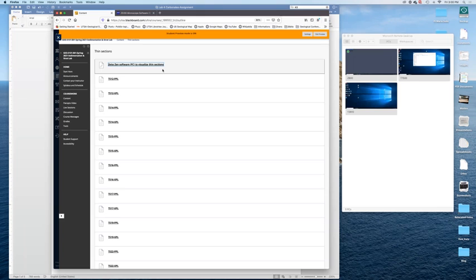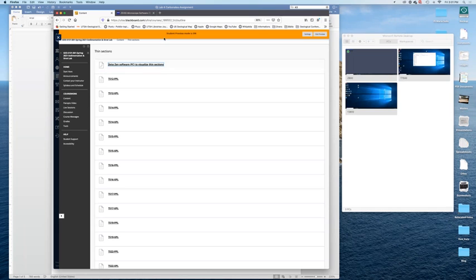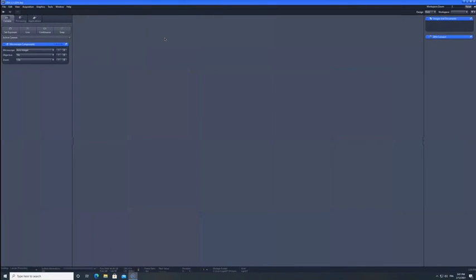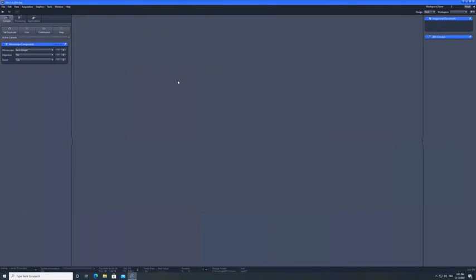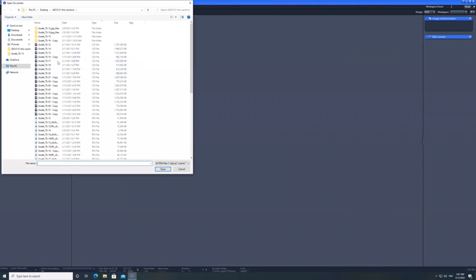So you will have to, I'm summarizing here, install the Zeiss Zen software and then download this zip file and unzip it on your local drive. Then you will be able to go and open the software.